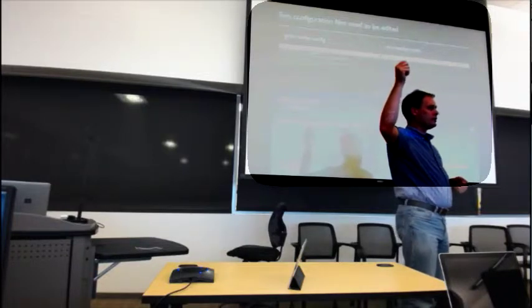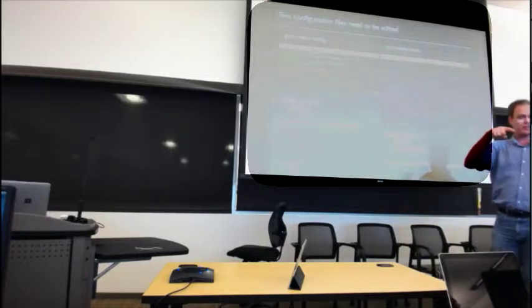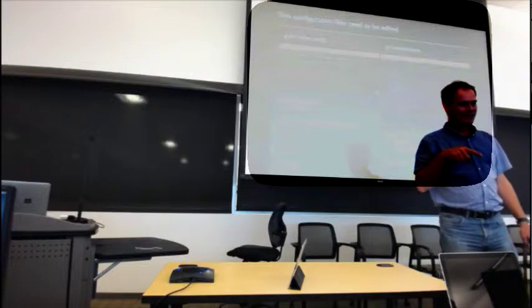So where do you run this? Just in Scratch. Like you'll see in the experiment Scratch directory, there's an Anton directory. Right now I'm at the reg d CXI whatnot, then you need to go into the Scratch directory where you have write permissions. I don't. You don't? I think I don't. That was the problem earlier. Can you touch a file in that space? Yeah, I tried to. I don't.